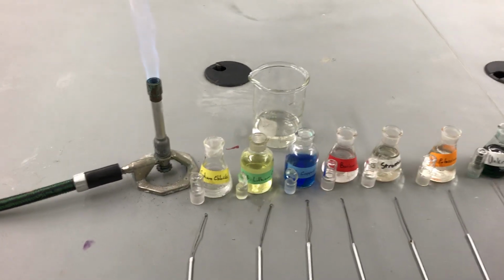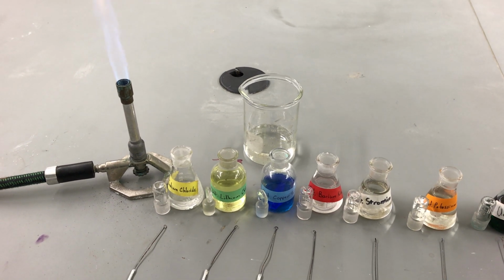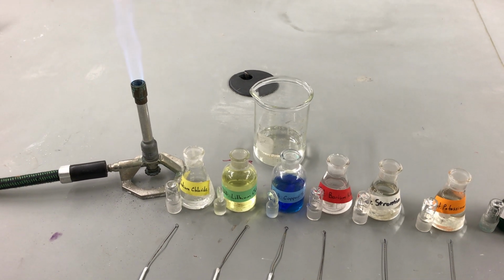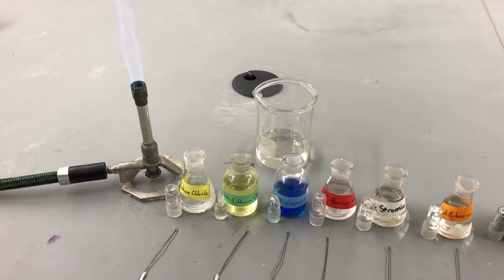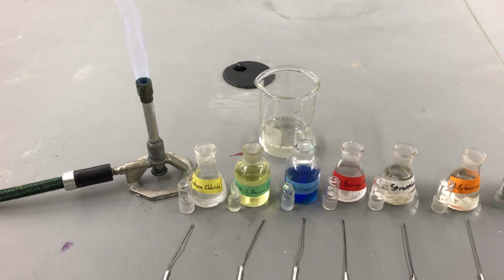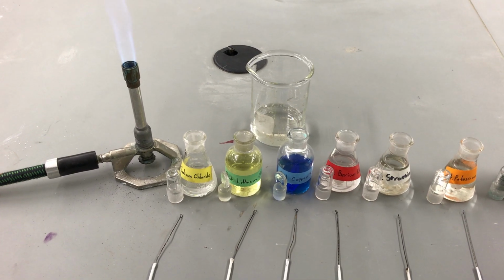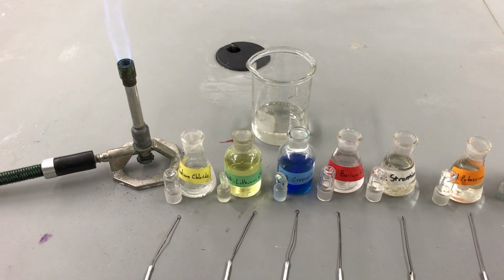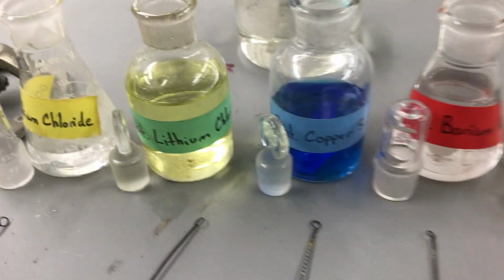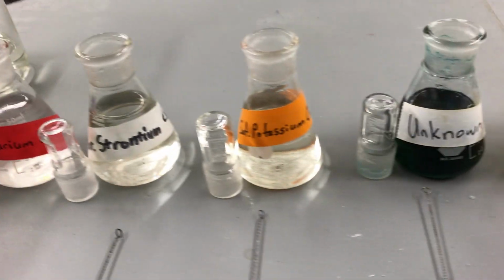Alright, ladies and gents, now it's time to conduct our flame test for our inorganic elements. Now, as we know, when subjected to heat or other energy, inorganic elements emit light. This is because their electrons are essentially jumping up from lower energy levels to higher energy levels, and as they fall back down from the high energy levels to the low energy levels, they emit light of specific wavelengths depending on the elements present.